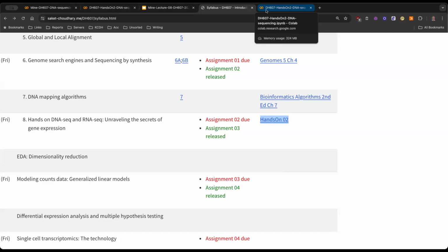It took me a while to think about what I want you to see. And the answer was in the slides that I initially started with. If you remember, we started talking about sickle cell disease, right? And I mentioned that there's a mutation that happens in the HBB gene. We are going to visualize what that mutation really looks like, okay? I'm not going to do it, you're going to do it. You'll be able to see whether the mutation that I initially showed you actually happens in patients who have sickle cell disease, okay?